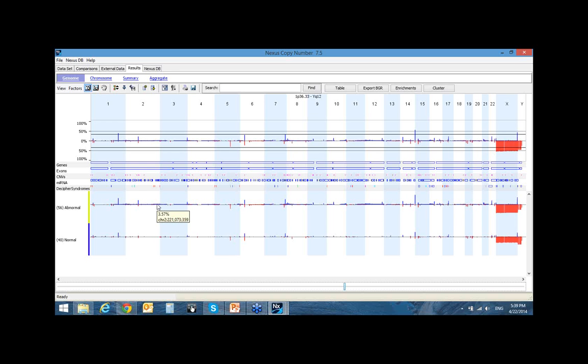You can see here, 3 or 4% of the sample had that gain. So that's basically coming from probably 1 or 2 samples from there. And you also have loss. But this is not a good sample plate for research, but I just show you the idea of what you can do.